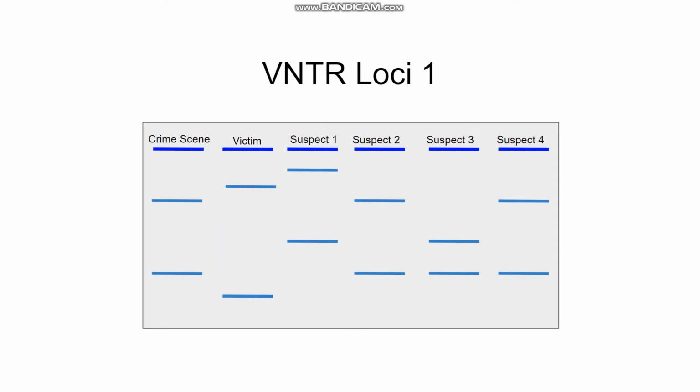As we can see, the DNA cannot belong to the victim since neither of the 2 alleles match the sample. The difference in the location of the bands means the DNA pieces are of different lengths. Since the alleles don't match the sample from the crime scene, we can conclude the DNA sequences are different as they had to be cut by the restriction enzyme at different sites. We can also rule out suspect 1 for this same reason.